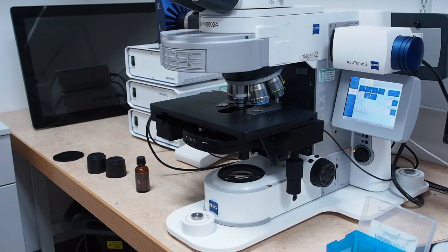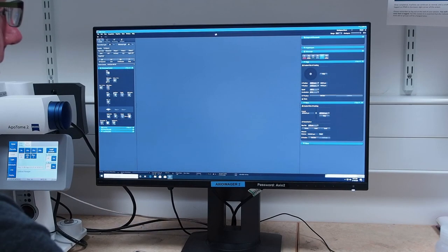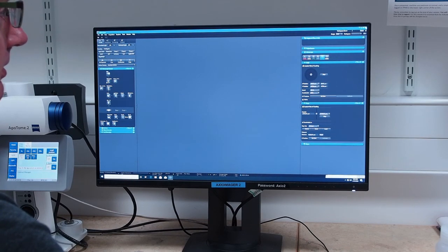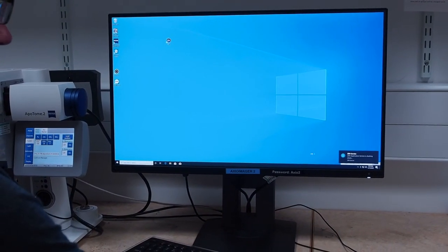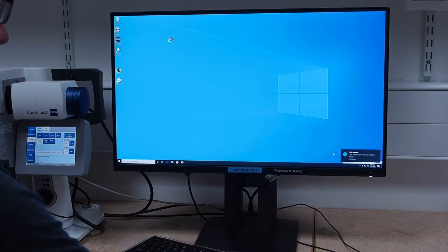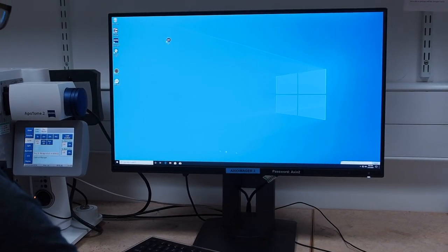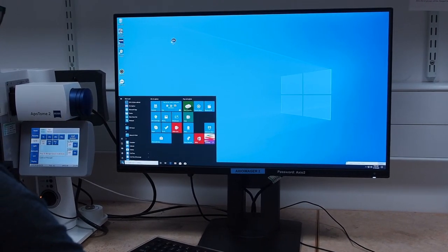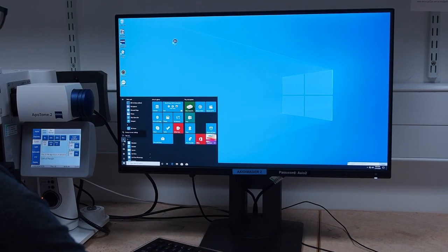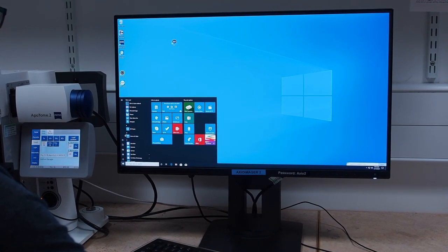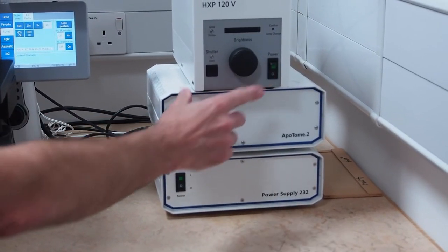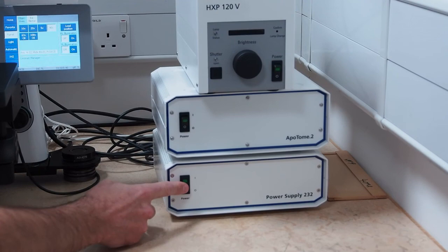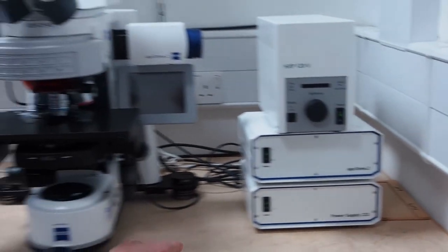Ensure you have removed your samples and cleaned the objectives used. Now you can close down the software and hardware. Ensure all images are saved then click the X to close Zen. A warning message will appear telling you Zen service is still shutting down. Wait for this to close before logging off the PC.